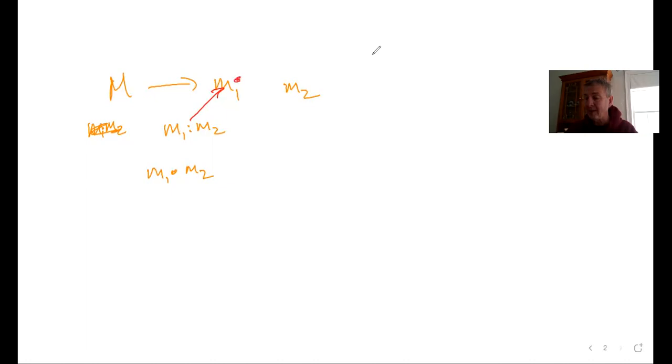The one that gets the electron is uncharged. The one that doesn't gets the positive charge, right? So a covalent bond is each atom bringing 1 electron. If one gets knocked out and this one keeps 1, this one remains uncharged, whereas the other one that lost the electron is positively charged. So you could get 2 results.